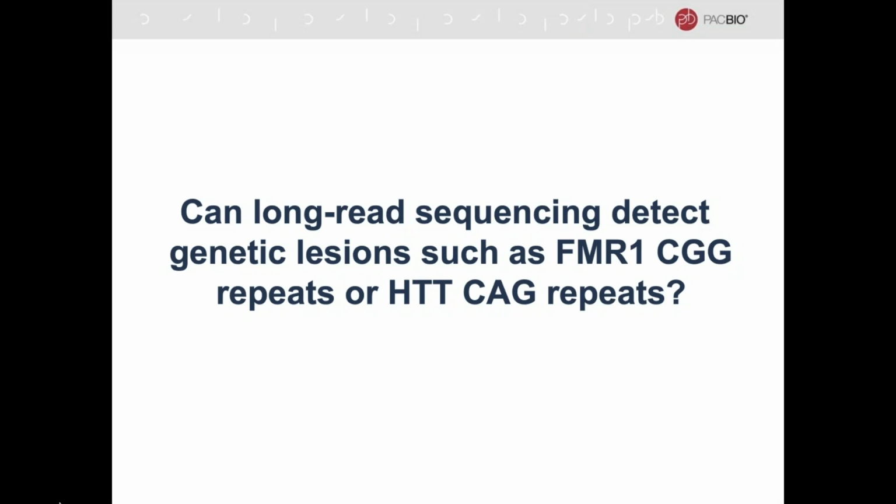So in the case of the HTT repeat, we actually did this. In this case, the region that we were looking at, we were trying to phase the actual CAG repeat with a SNP upstream. And in DNA space, those are separated by about 200 kb. So even that is too long for a PacBio read. So in this case, we targeted it in the RNA space. We generated total cDNA and then amplified this region using a gene-specific primer set. And it made about a 10 kb amplicon. And in that case, we're able to sequence it and generate high-quality data that then could phase the SNP 10 kb upstream from the repeat and associate how long the repeat was with the carriage of the SNP. And so I think there's a lot of different ways you can target sequences.